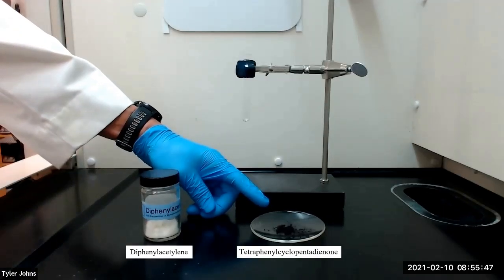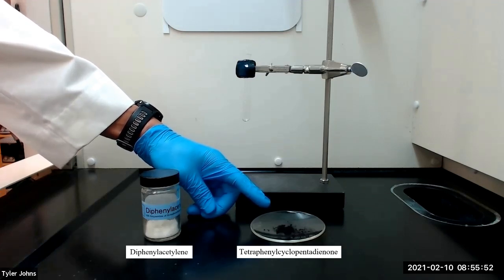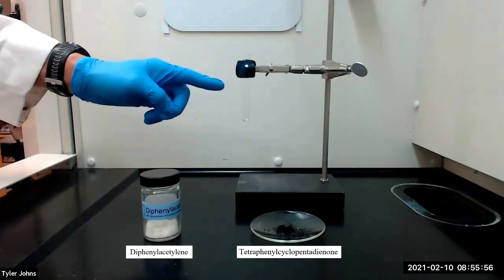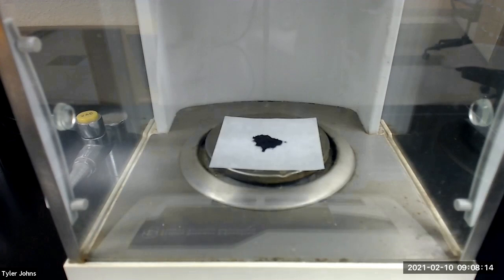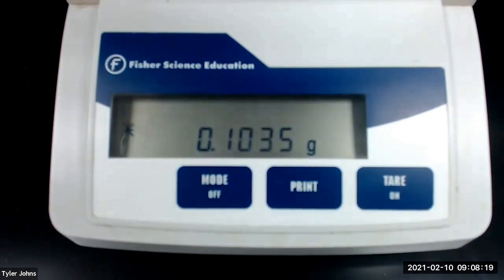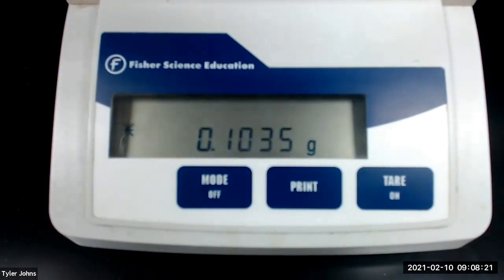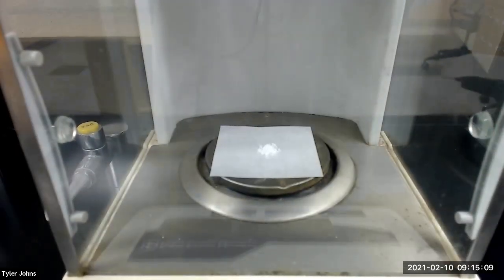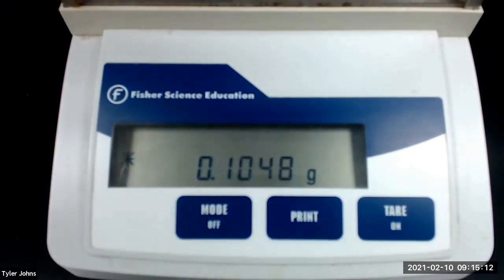Let's get started. To begin, we will place approximately 100 milligrams of tetraphenylcyclopentadienone, which we had previously prepared, and 100 milligrams of diphenylacetylene in a small test tube. The mass of tetraphenylcyclopentadienone that we will be using is 0.1035 grams, and the mass of diphenylacetylene that we will be using is 0.1048 grams.